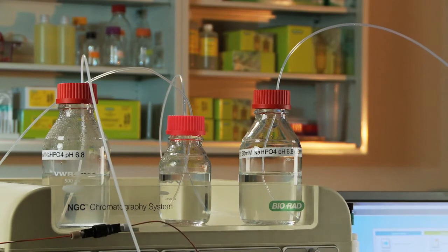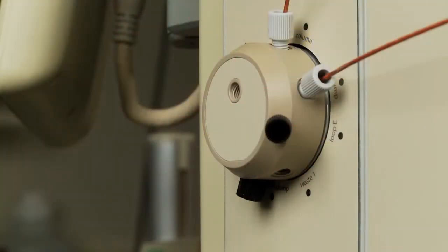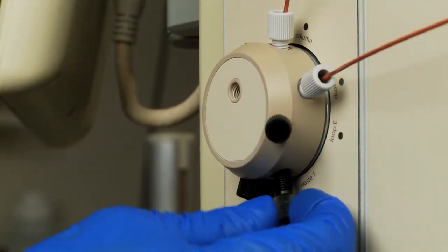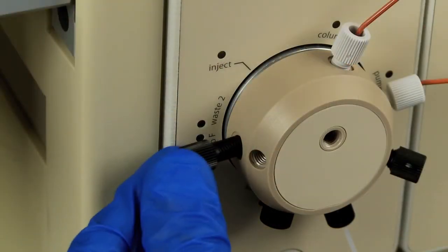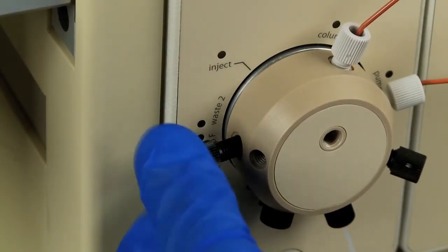Inlet solvent filters may be used. Now you will make tubing connections to the inject valve. Connect the waste lines to waste ports 1 and 2 on the inject valve and place the ends into the waste container.